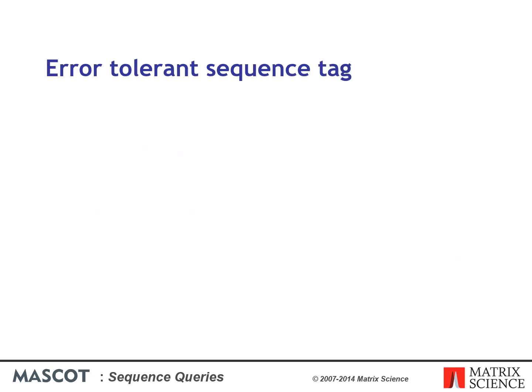If the sequence is in the database, it is easier and safer to perform an MS/MS search of the peak list. In this sense, the standard sequence tag is obsolete. The error-tolerant tag, which can find a match when there is unsuspected modification or a small difference in the sequence, is very powerful and very useful.